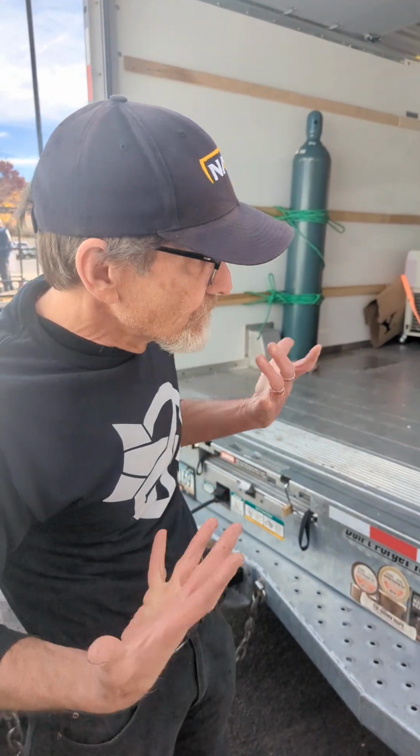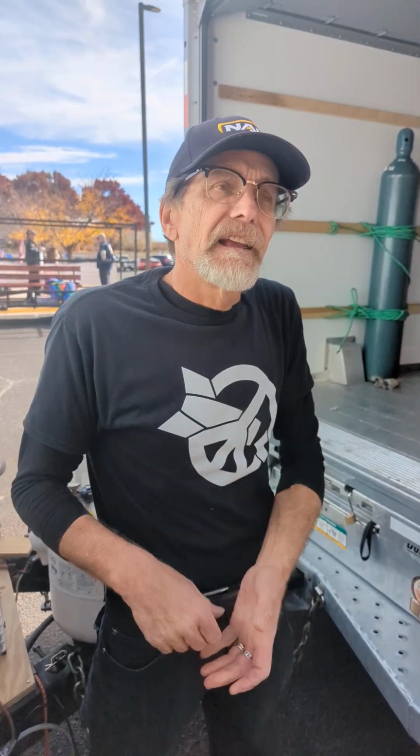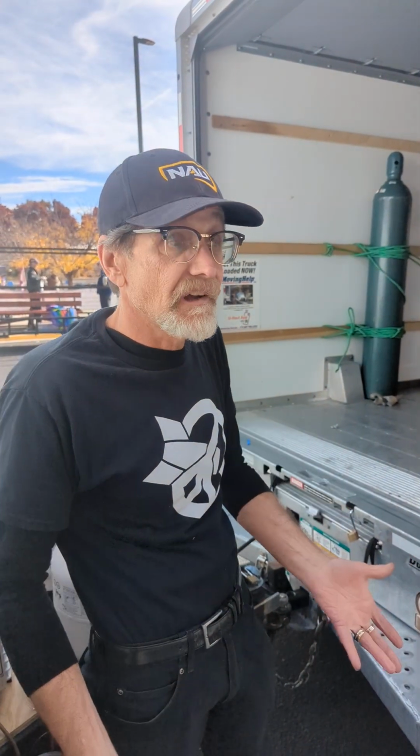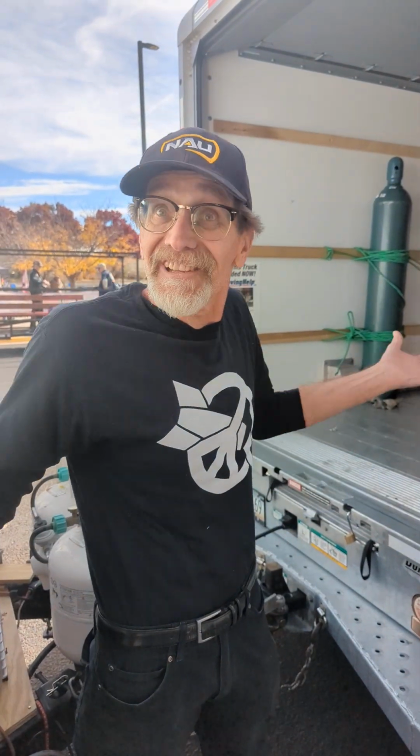Like, I've recently got into contact with folks from Canon City, Colorado, and this unit that's in this trailer, under its test development last week, it's produced real data on water samples. I was able to tell them these are less than 10 micrograms per liter. That's good news, you know, and it is good news. That's what I tell people, because my opinions are guided by what the data say.